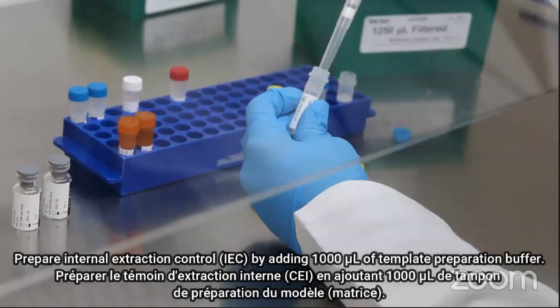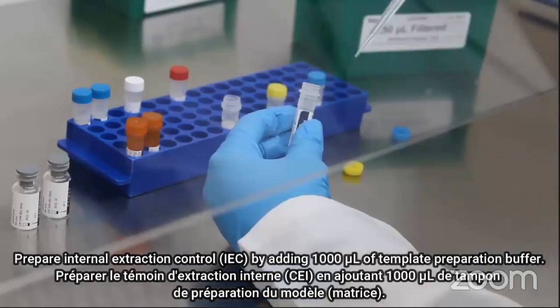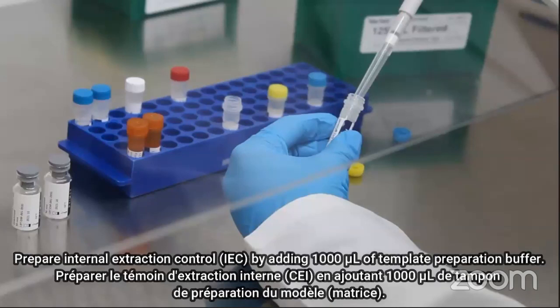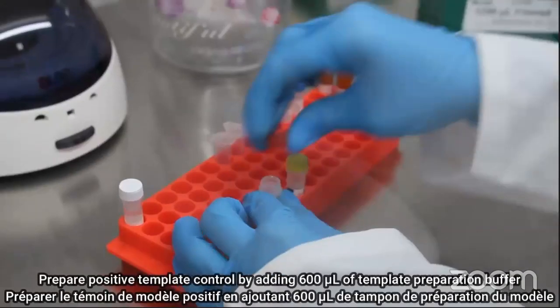Then prepare the internal extraction control by adding 1000 microliters of template preparation buffer, which is the yellow cap tube. Mix it gently. Now we have taken the buffer and we are adding it to the IEC tube, mixing it. You have to be gentle because otherwise it will make bubbles in the tube and that can interfere with your process. Now take 600 microliters of template preparation buffer and add it to the positive control tube.